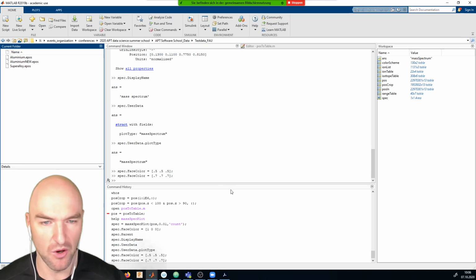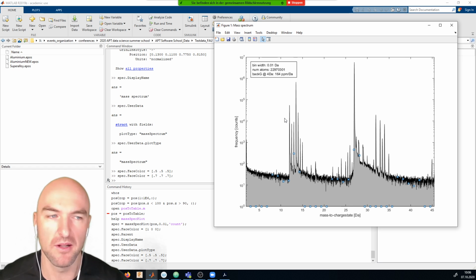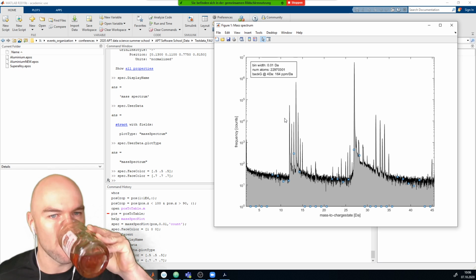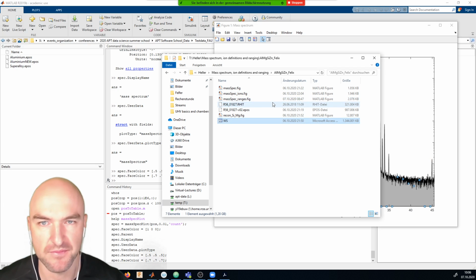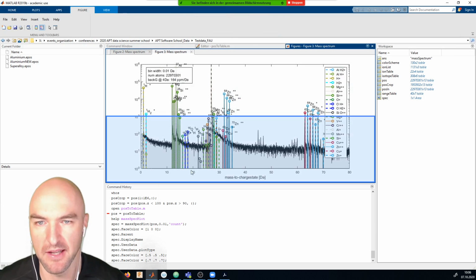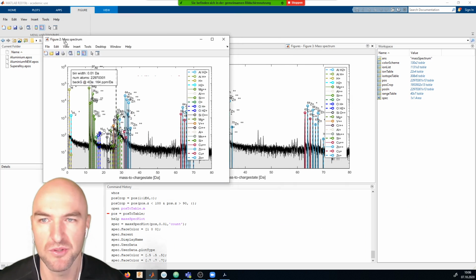These graphics objects will appear quite a lot throughout our analysis, and you will see that they can be very rich in information. I will just show you right now what a mass spec figure will look like. This is one that you will be making in the next session with Martina Heller as your host.